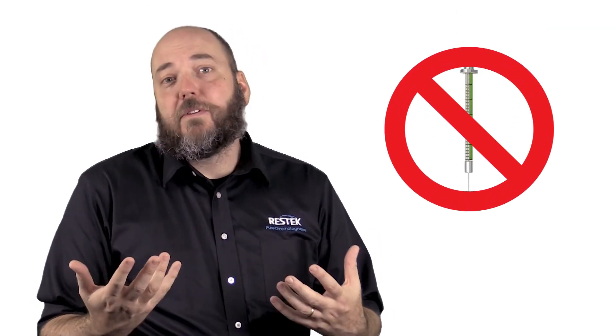No injection instrument blanks really help you focus your troubleshooting and save some time, and I have found them to be particularly helpful. Thank you for joining us for this ResTech tip, and good luck.